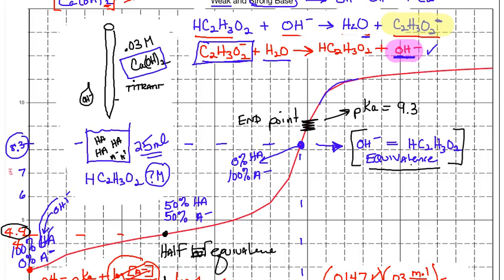Okay. Now we've got all of that. I think what we have left to do is determine the percentage of the acid and base. We just did that. And I think all we've got left is to determine the final pH. So the final pH, we want to find this, and this is really a lot of fun here. I think so. And the reason is because the final pH just represents the excess chemical that we added beyond the what?